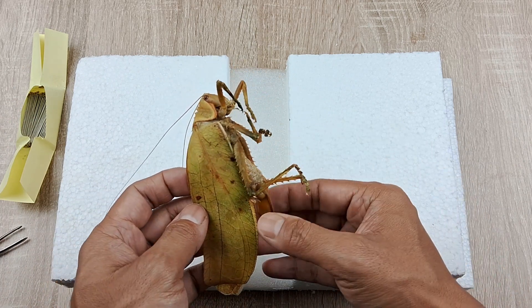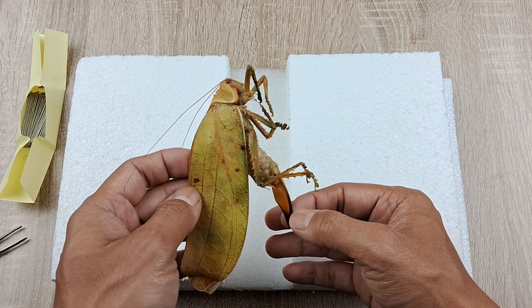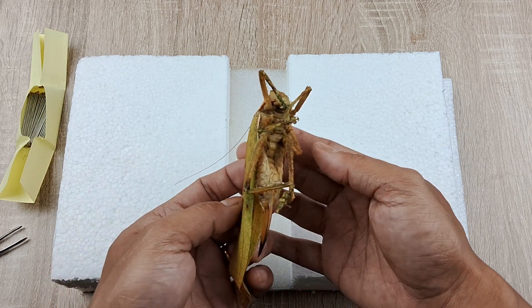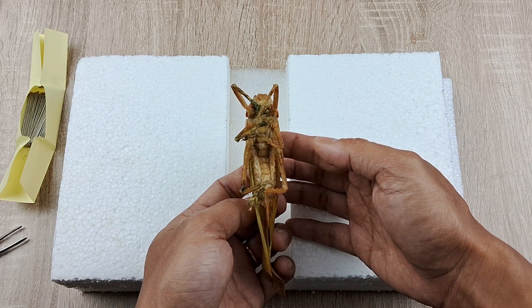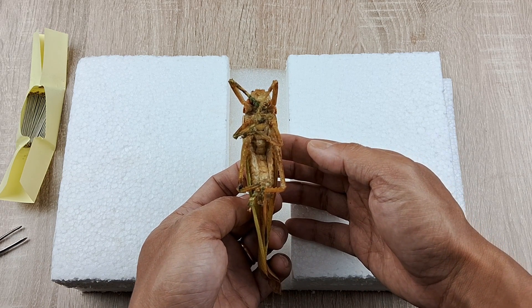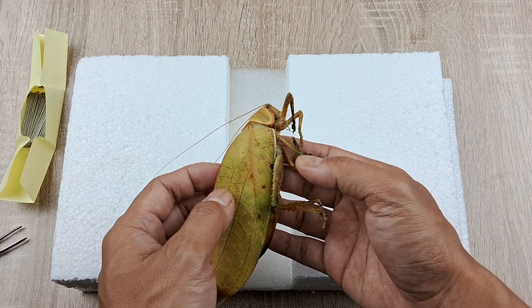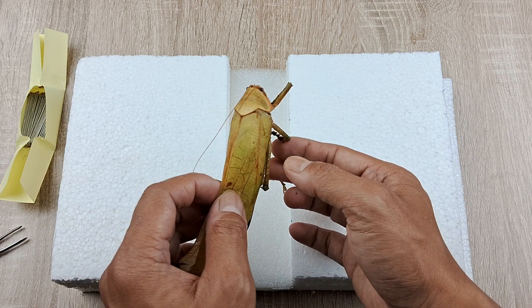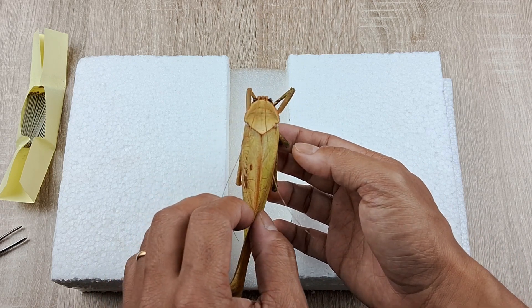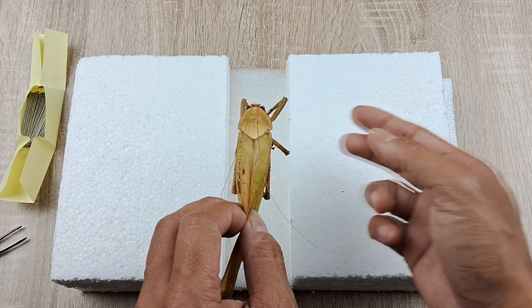Freezing the specimen for at least 5 days to a full week is recommended. During this period, all microorganisms present in and on the specimen, including ecto and endoparasites if present, will be killed by the extreme low temperature. This helps to a great extent in mitigating the decomposition, especially in the abdomen, that is bound to occur during the drying process after pinning the specimen.